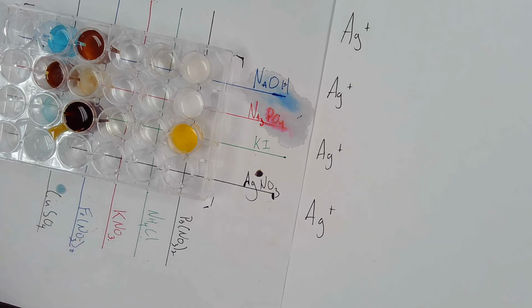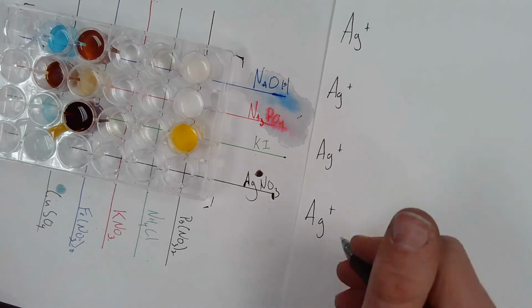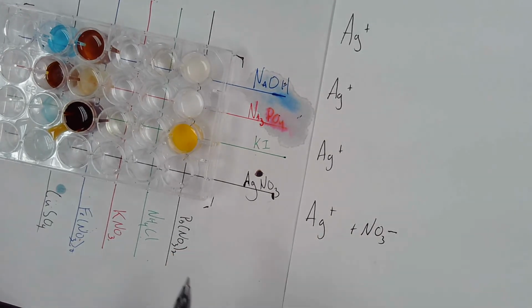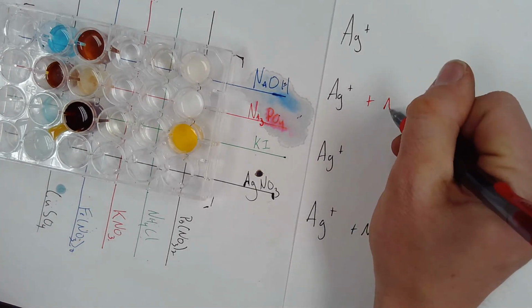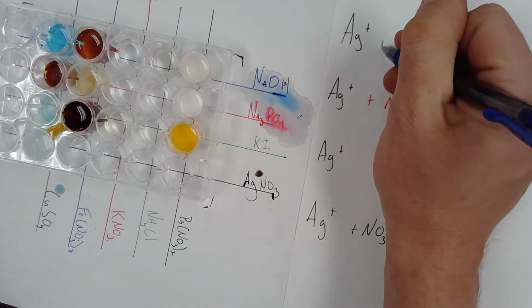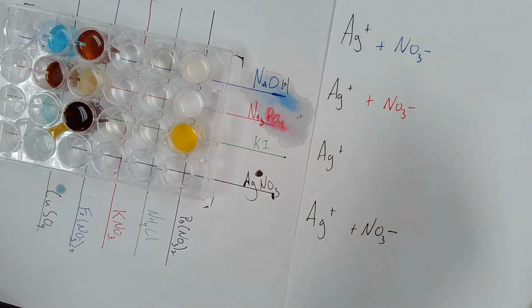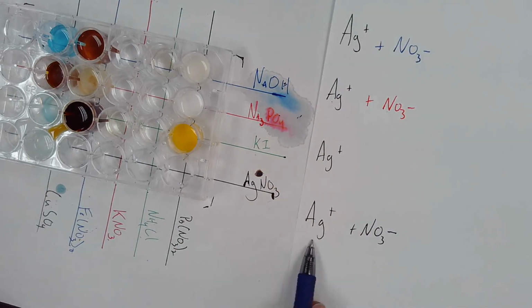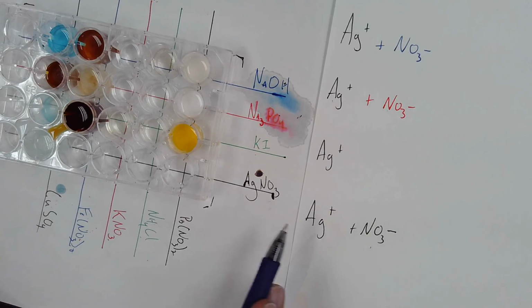Now, if you look, I have a nitrate, and a nitrate. It doesn't matter what it's attached to, right? Because here I've got lead(II) nitrate, but the lead doesn't contribute anything. It's only the nitrate. Here I've got potassium nitrate, but the potassium doesn't change the reaction. It's just the nitrate I need. Here I've got iron nitrate. The iron doesn't change anything. It just makes that. But check it out. This plus that, this plus that, this plus that. What do you recognize it's going to make compared to this?